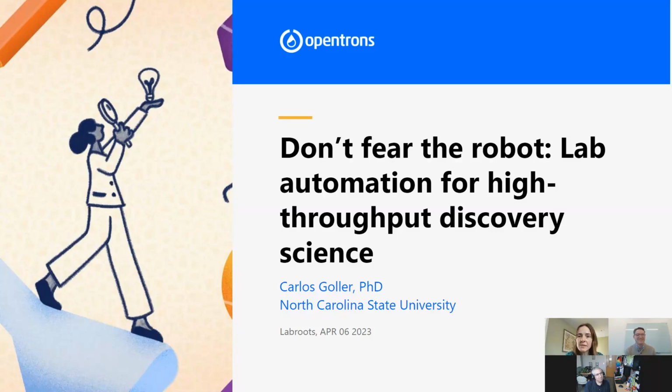I also think that looking for lots of help is really important. So Greg mentioned that Opentrons and all automation vendors should be able to give you a significant amount of help in terms of analyzing what it is that you want to automate and giving you advice about how to do that, and whether you should do it, or what the pros and cons are, timing studies, all these things to really give you some information about what that automated solution would look like.